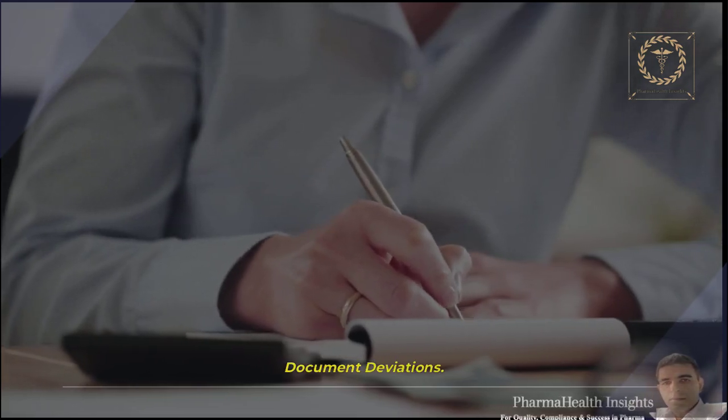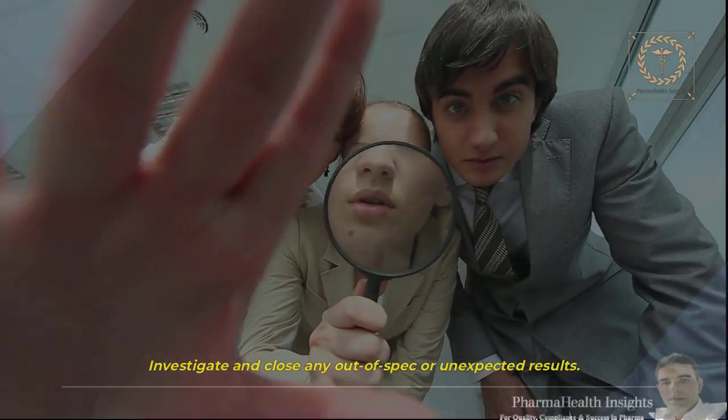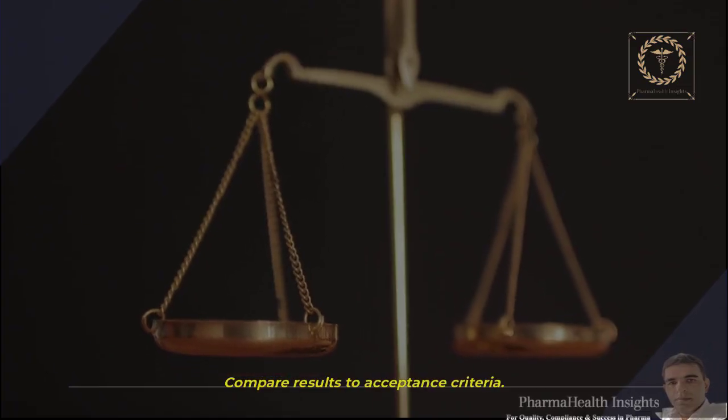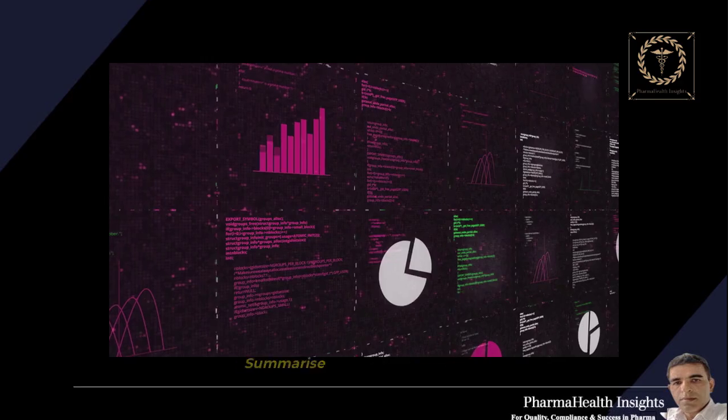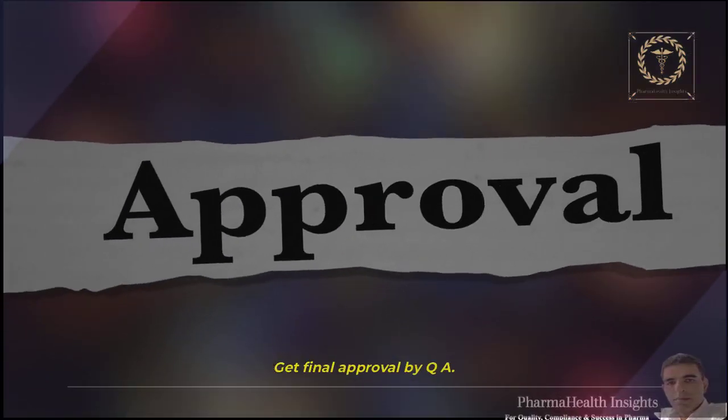Document deviations. Investigate and close any out-of-spec or unexpected results. Prepare the PQ report. Compare results to acceptance criteria. Summarize deviations, corrective actions. Get final approval by QA.